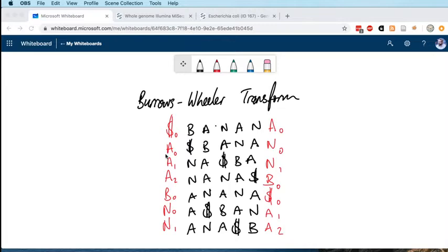So searching for instances in a string this simple is relatively straightforward. So we looked for instances of this string ANA. Obviously, if I was just doing that by eye in our original search string, that's a relatively straightforward thing to do with such a simple thing to search. Our genome here is very straightforward. It's only got 6 characters in it. But in a human-sized genome, a 3 billion base pair genome, searching for short strings in such a large database is a tricky thing to do, and the Burrows-Wheeler transformation makes that much more straightforward.